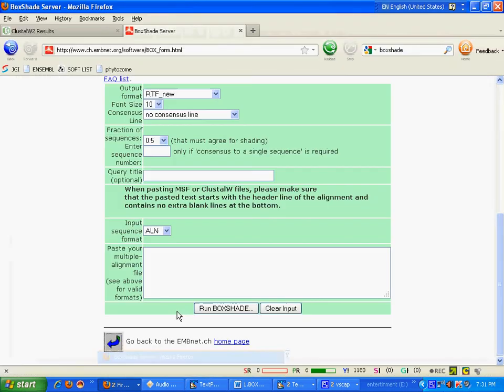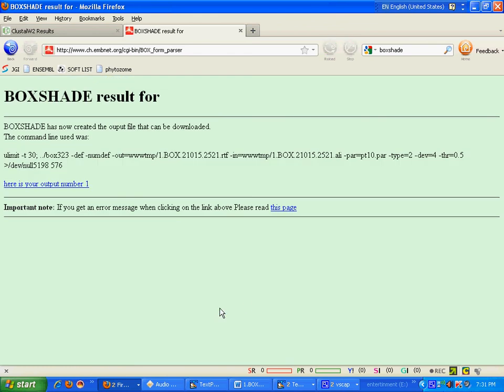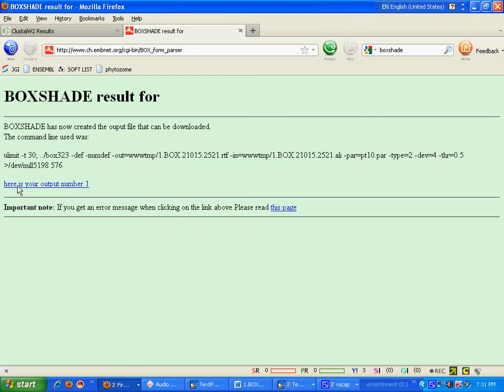In the BoxShade box. And then run BoxShade. It will take few seconds. And now, here is your output. Click on here is your output file.